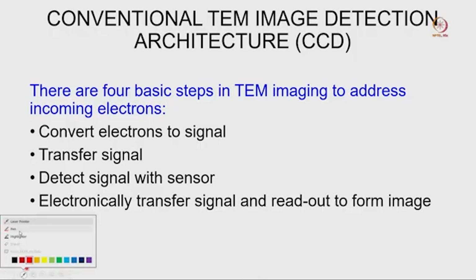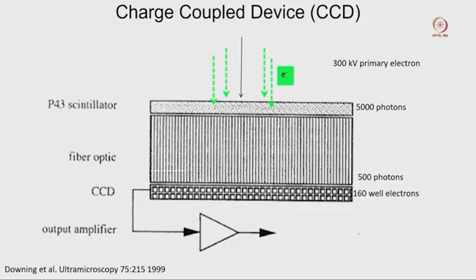So, what I was trying to explain in the last slide, sometimes what happens is that if an electron is coming here, we are expecting that the electron will go straight, but most of the time after hitting, that electron will just start spreading in this direction. So, it will be like all this direction.